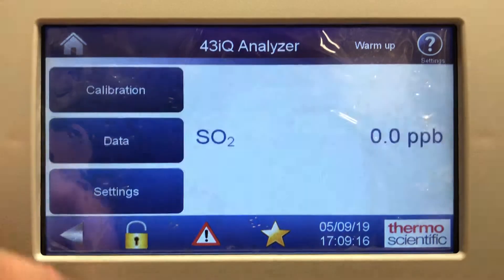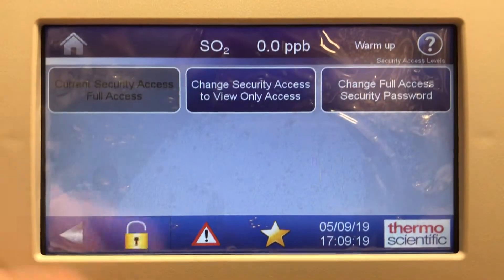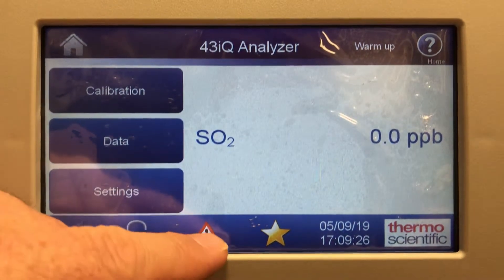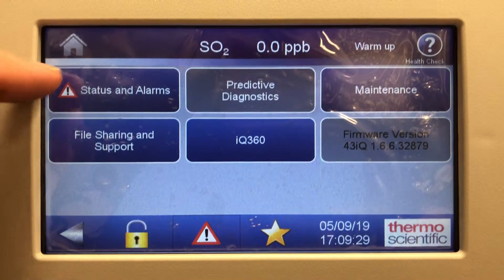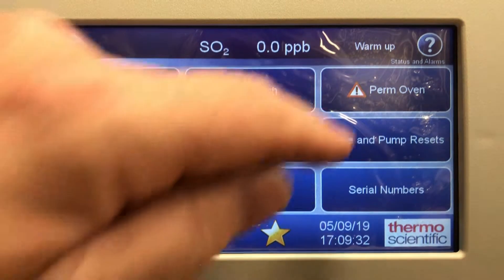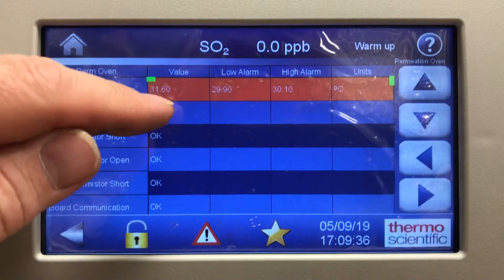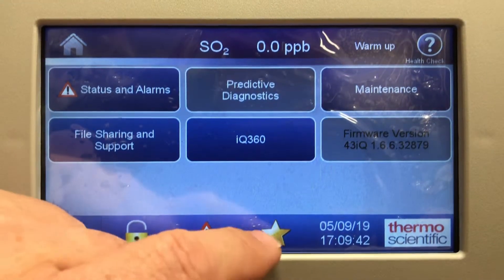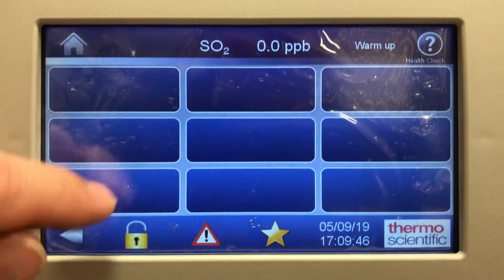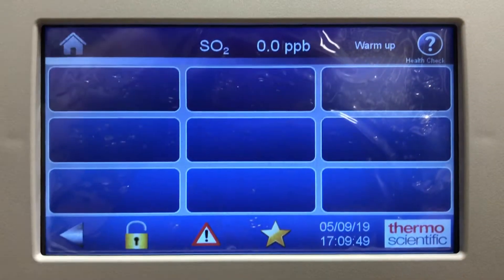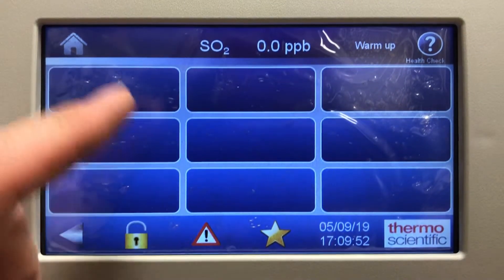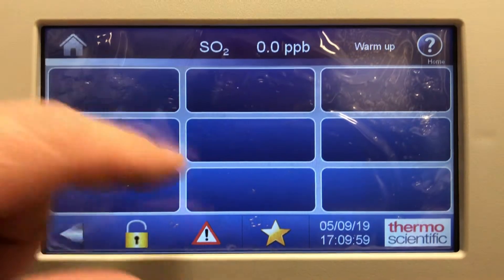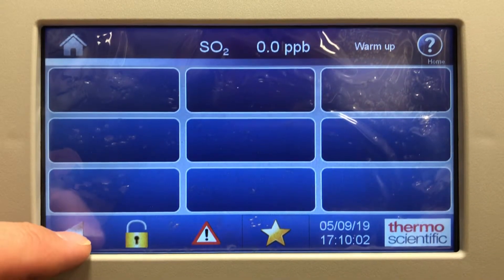Down here there are quick hot buttons — one takes you into the screen to change security access, another is the status alarms shortcut so you can quickly see what's wrong. The perm oven is still cooling down at 31.6, and we're looking for 30.1. The star button lets you program these buttons to be any hot buttons you want for quicker access to the analyzer sub-menus, so you can set them to access straight from the star feature.